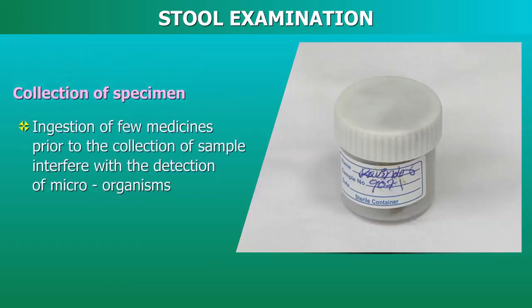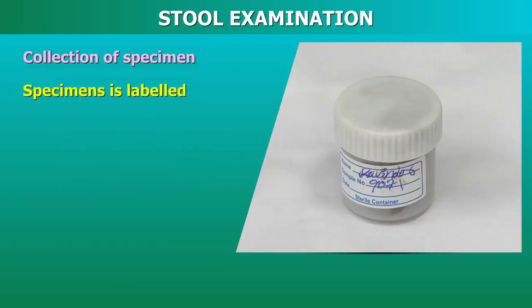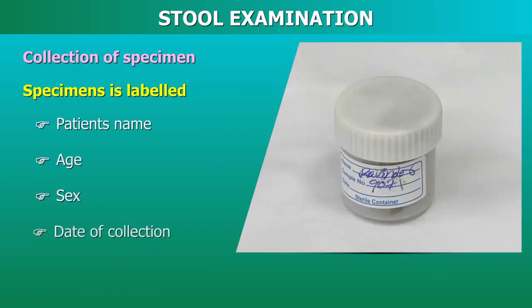The ingestion of some medicines prior to the collection of the fecal sample may interfere with the detection of the microorganisms. All specimens must be properly labeled with the patient's name, age, sex, and the date of the sample collection.